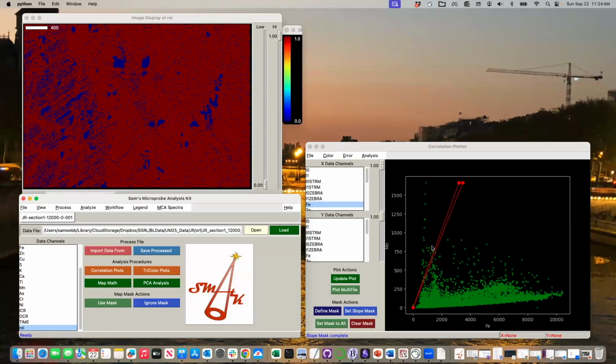That one's kind of weird looking. Let's do a different one. Maybe you want to do, let's see. My manual math is not great right now. Let's say 2.5, 0.1. There we go. We'll do that one. And then we can highlight that mask.